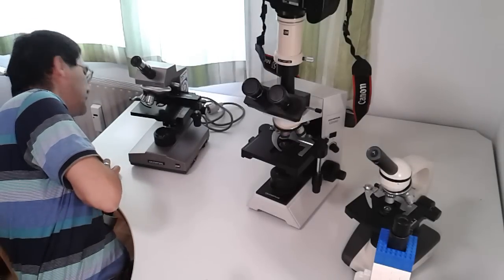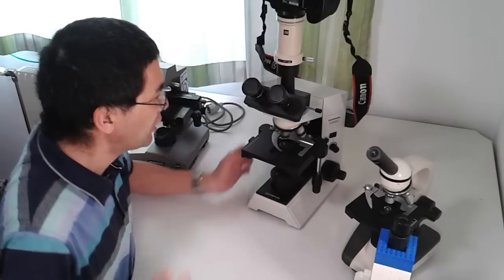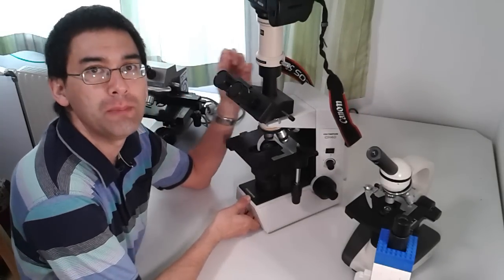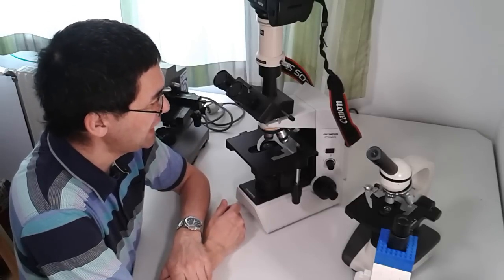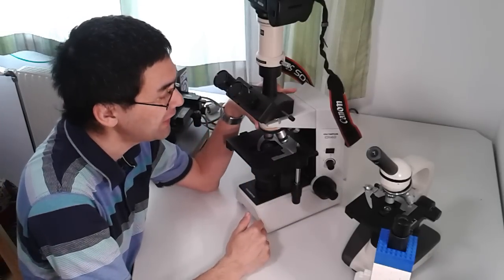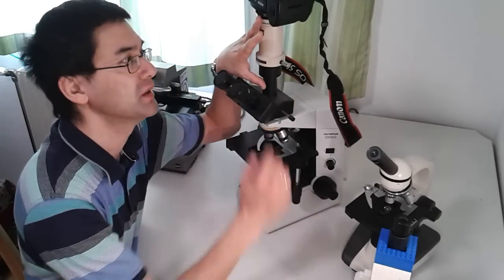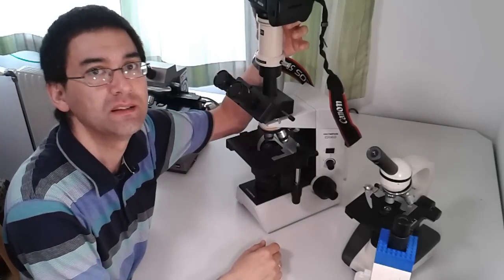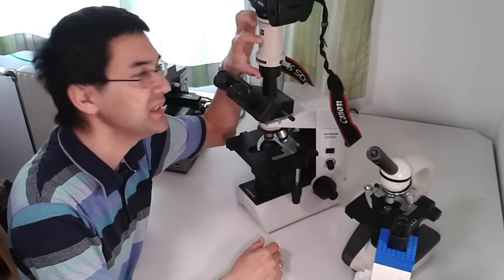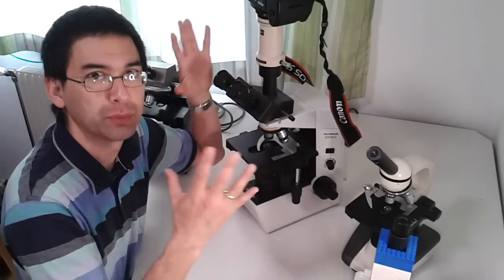I'll put the Euromax stereo microscope — a Dutch company — aside to make space. Now I'll start with the large microscope: the Olympus CH40. It's no longer manufactured. It has five objectives on the revolver, which is quite convenient. Very prominent is the photo tube, which allows me to connect a single lens reflex camera, and there are specialized photo projection eyepieces inside.